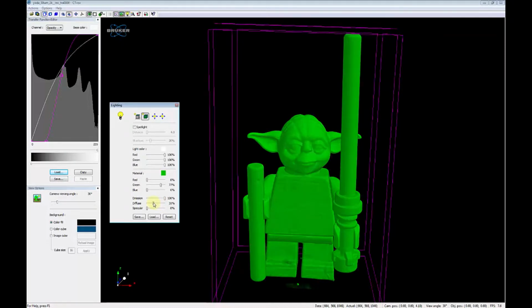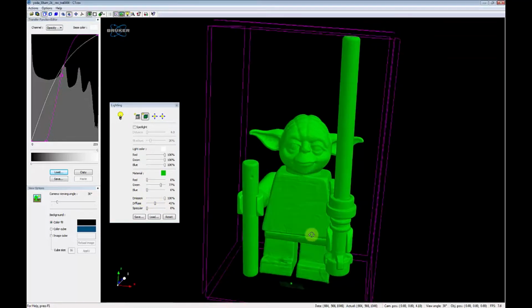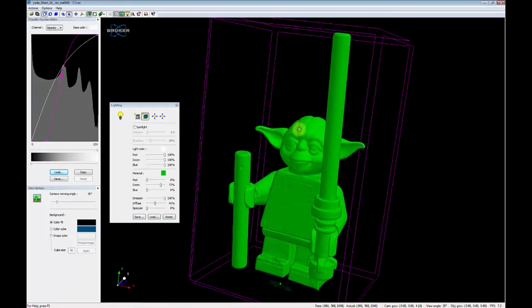This is going to be something highly tailorable based on what you're trying to make your final image look like, but generally I use lower to middle values. There are some cases where you might want to go up to higher values, but that's going to be on a case-by-case basis based on what looks good for your data.